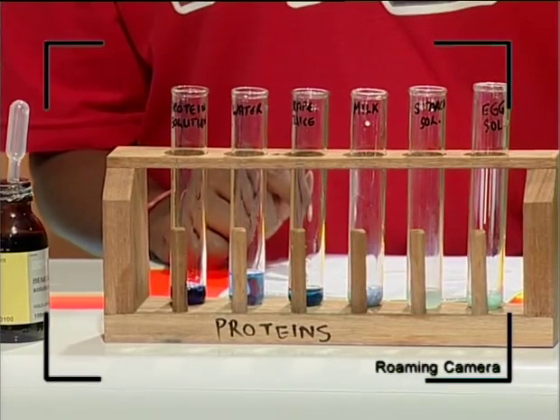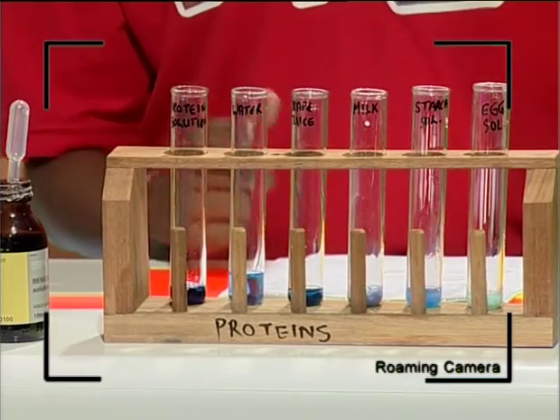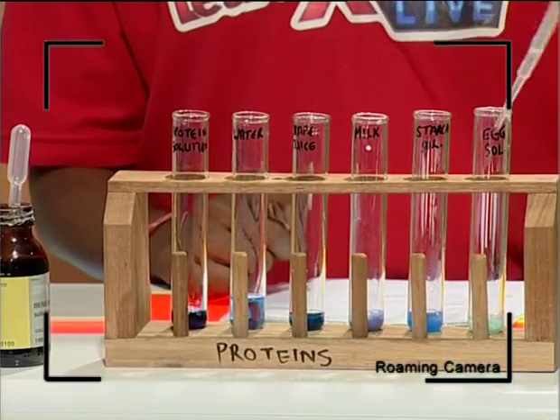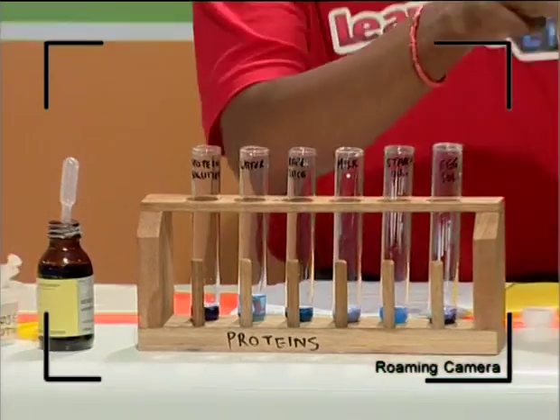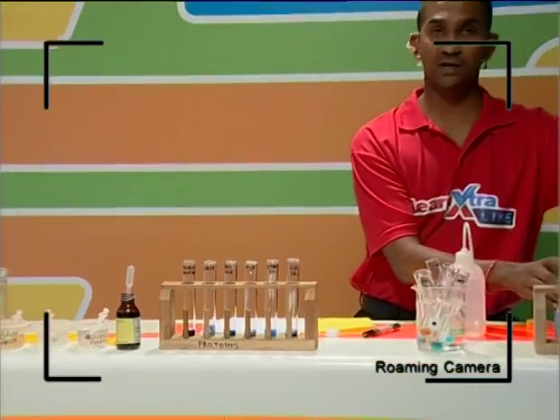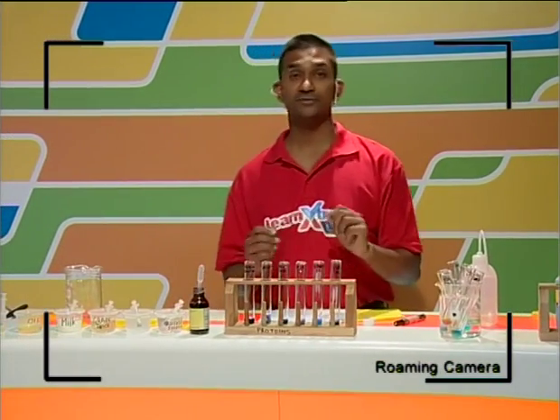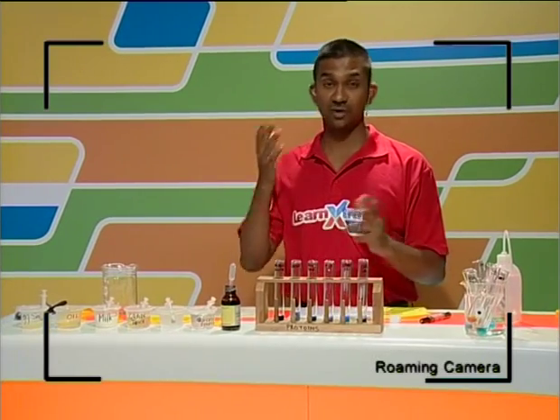I know you guys would probably try this during your life science lessons at school. And it's important, guys, to again be cautious about how you use chemicals, never to leave these bottles lying around open in the class, and ensure that your teacher's around when you're trying different experiments. And never mix chemicals that you are not familiar with, because that could lead to serious problems, because you may not know how they react.